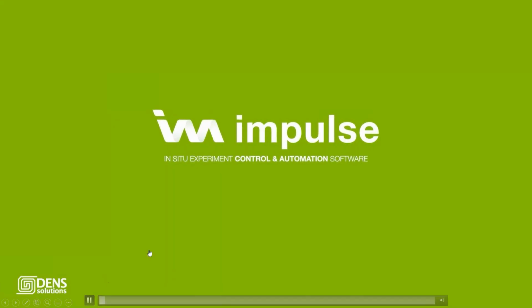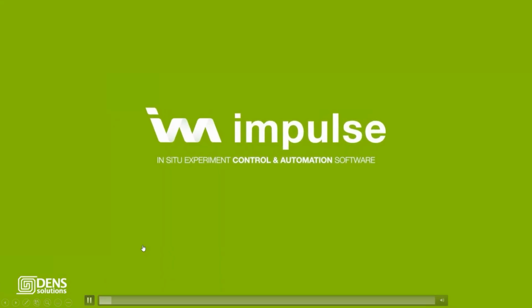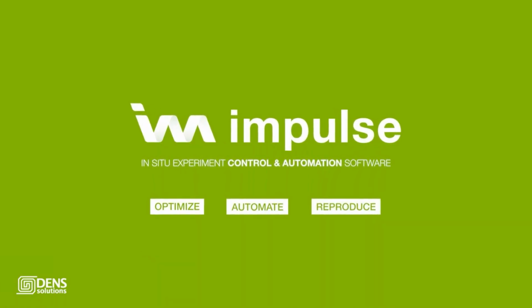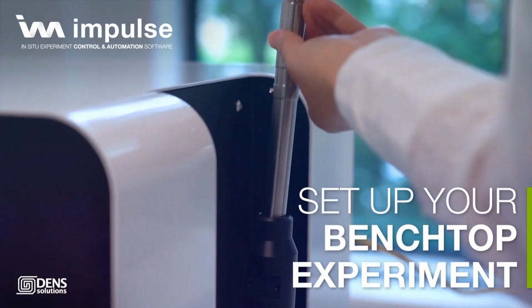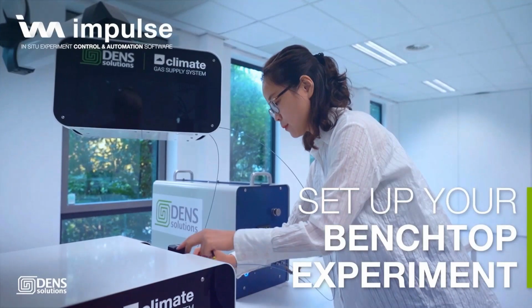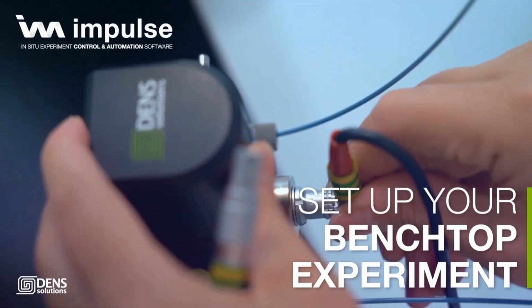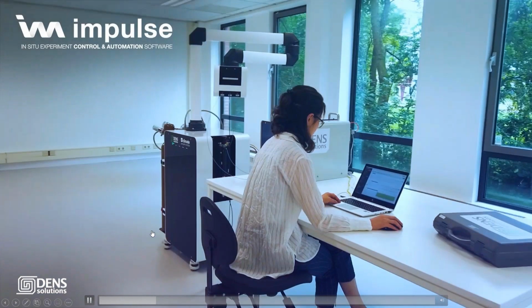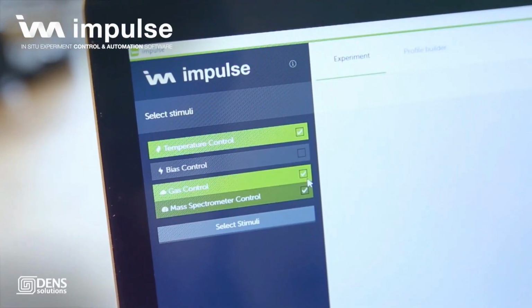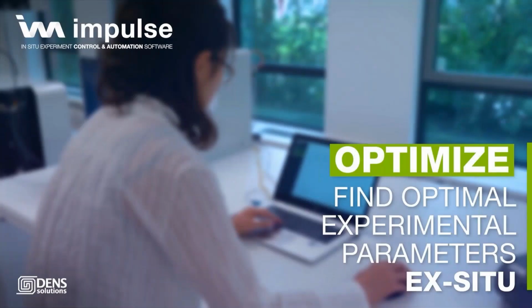So this is actually a software. You can control and automate your experiments. Firstly, I will set up my benchtop experiments by connecting all the tubings and assembling the holders. Now you will open the Impulse software and select the temperature and gas mass spectrometer control.